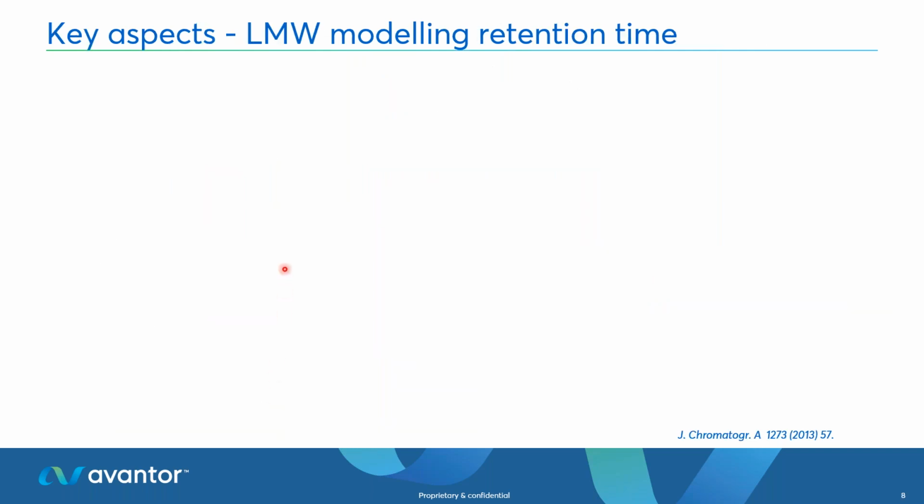So before I move on, I do want to share with you, as much as I did a lot of experimental and empirical experiments in the laboratory during my postdoc in Professor Peter Carr's group, I also did a lot of experiments to develop a really good computational approach, because we needed to model the retention times and the peak widths in a very good fashion to mimic what we were seeing in the laboratory, because we also didn't want to exhaust too much consumables and time spent with empirical experiments. We wanted to drive forward this project with a good computational approach.